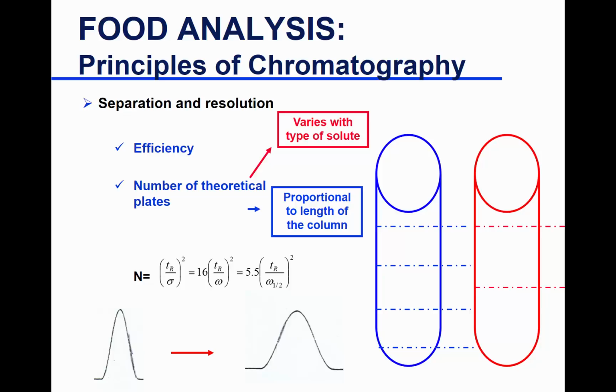Any questions about this? Is there a standard you can run to see basically how much your column's holding up over time? Yes. Like this example, I gave you caffeine as a standard. You can choose whatever you want. When the column is new, you can say, I'm going to test this column with this standard every time. And then you monitor it over time to determine whether you lost efficiency or not.